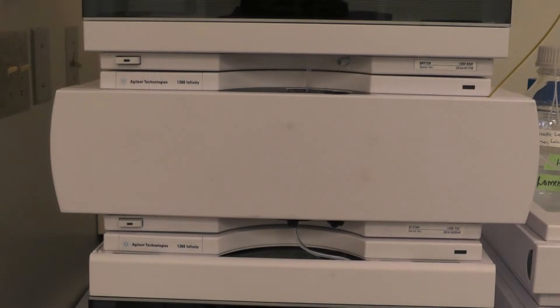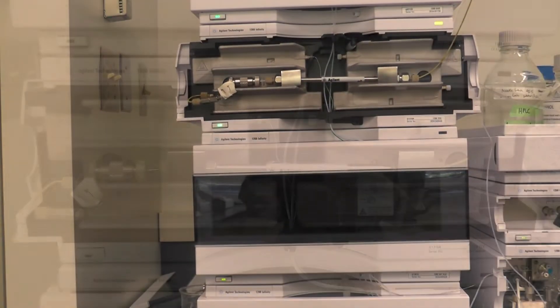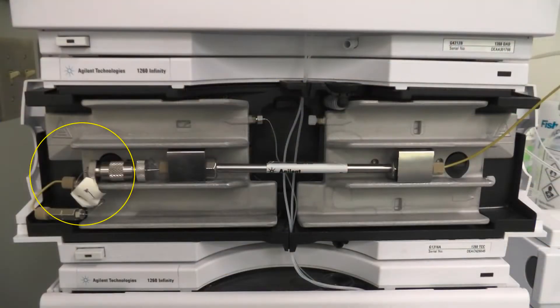The column compartment is where the column which contains the stationary phase is placed and where the sample is eluted from the column. The left-hand end is connected to the auto sampler and the right-hand end is connected to the detector. The temperature of both ends can be controlled and monitored.